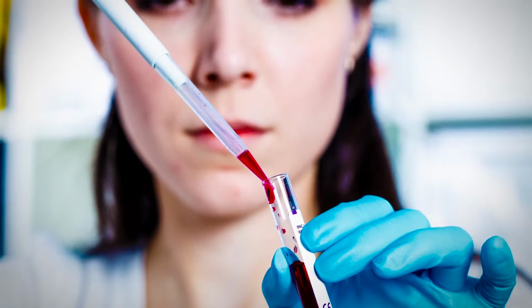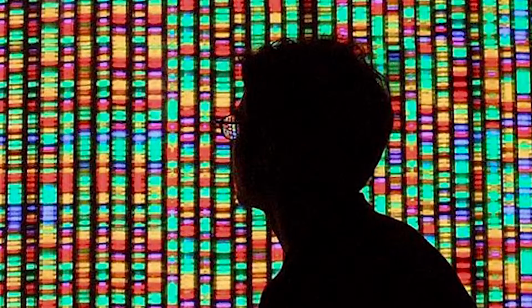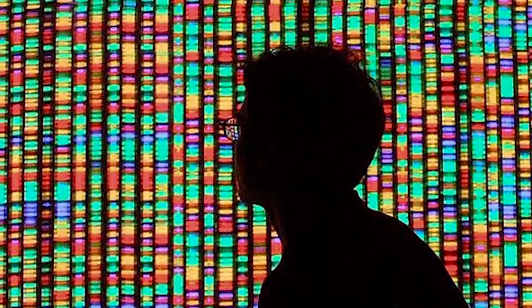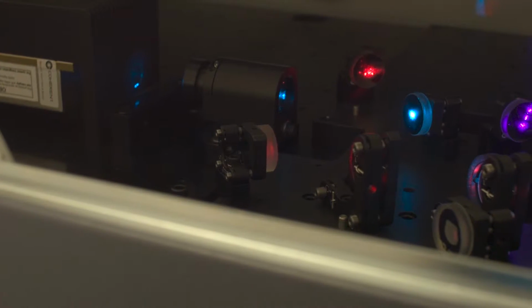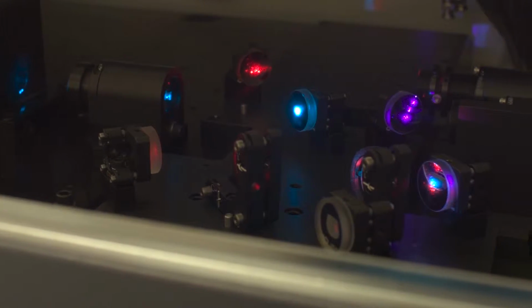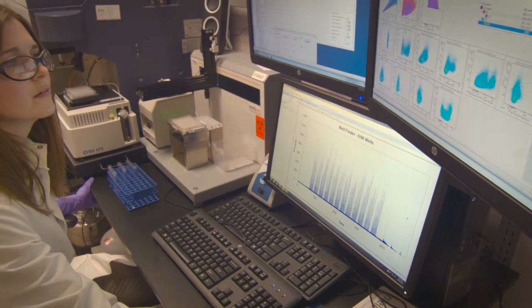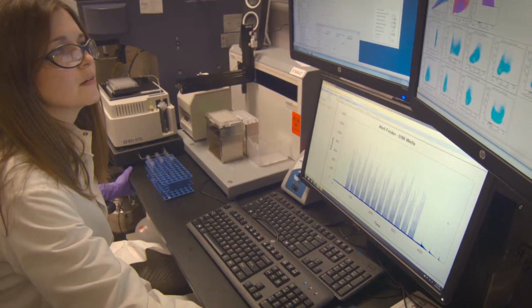If you remember, there was a big breakout in the Human Genome Project. We mapped the whole human genome, and now we know every A, C, T, G pair that was going on, but you don't hear a whole lot about it because it's hard now to figure out how that system actually processes and leads downstream to outcomes. Flow is different. Flow is happening right now, and so you're able to say, if I have treated this test subject with the drug, what are the outcomes, what are the results? And so this really lends itself well to drug discovery.